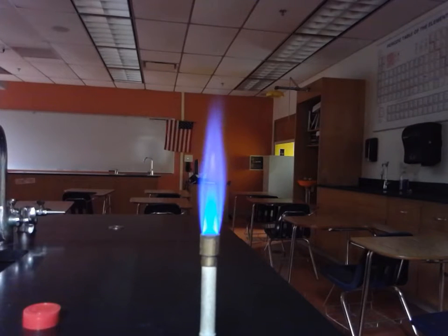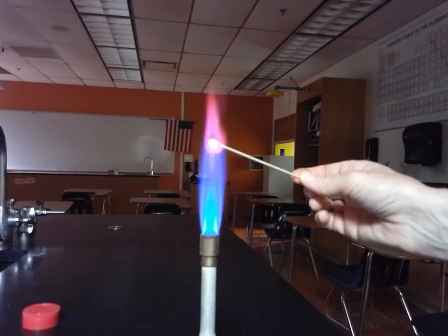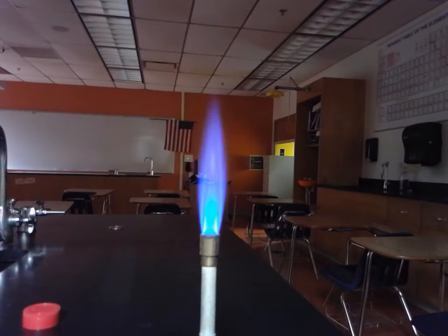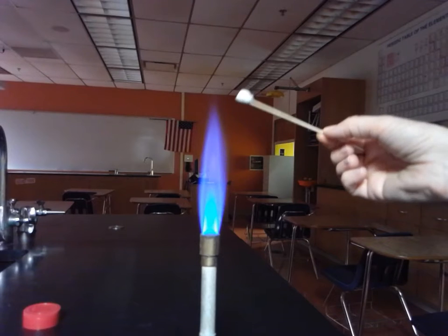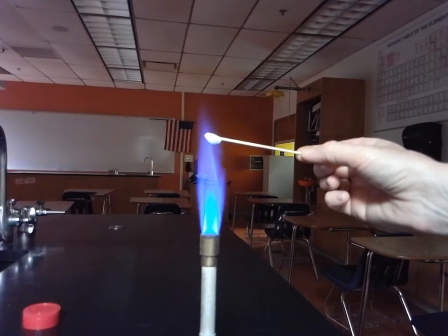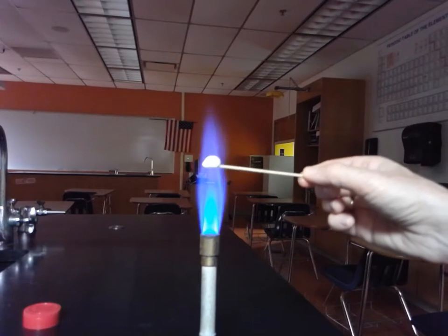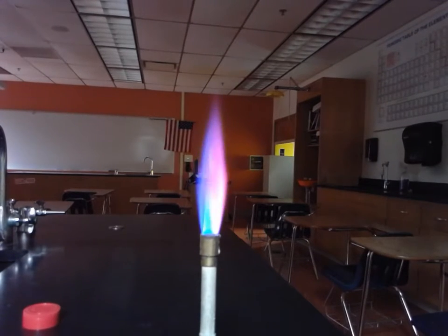This next one is lithium. Right, so I'm gonna do that again. You want to pay attention sort of to the top. I don't understand enough about cameras to know, but it looks like not all the color is coming through 100% for you. But if you can see that red, I'm about to lose it. Oh, it's permanently all there now. I'm not paying attention.